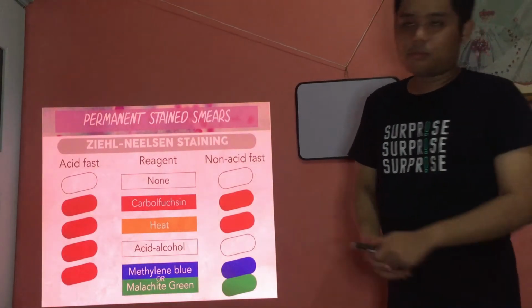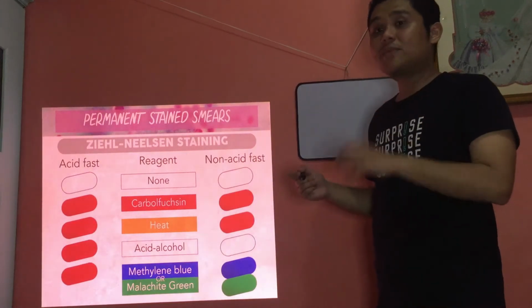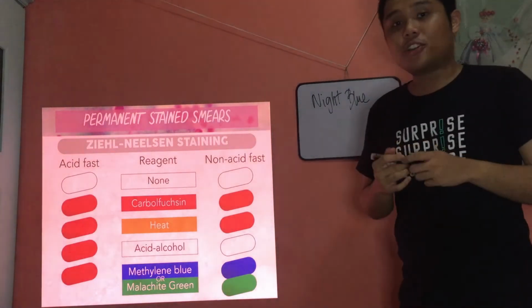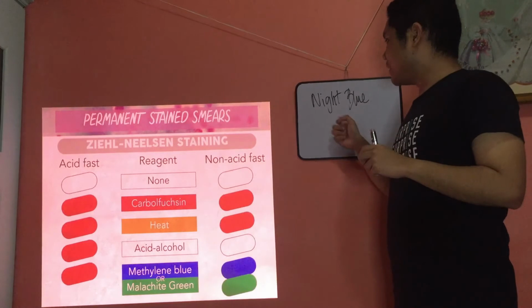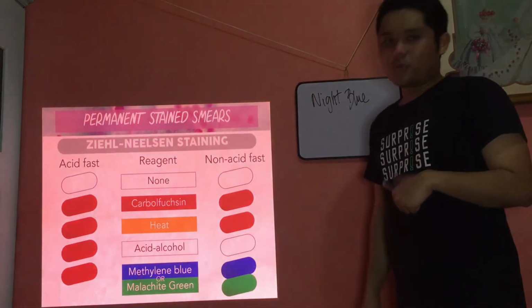Now, for our primary stain, diba, it's carbofuchsin. Now, if you don't have carbofuchsin, you can use an alternative stain known as night blue. Okay. That's according to your book in histotechnology. I'm not sure kung unsay color nila. Baka blue din. Okay, but seldom lang siya ginagamit. Okay, just an alternative stain. But primarily good carbofuchsin. Okay, carbofuchsin.